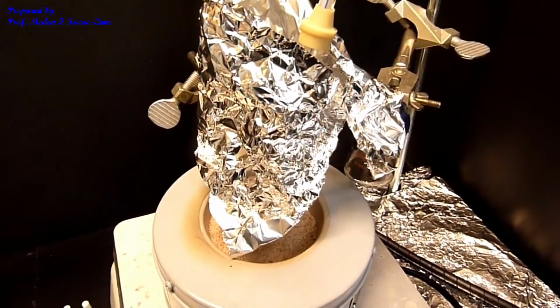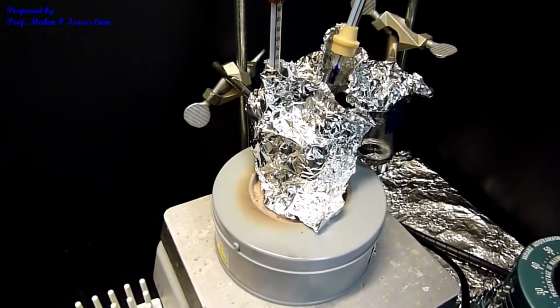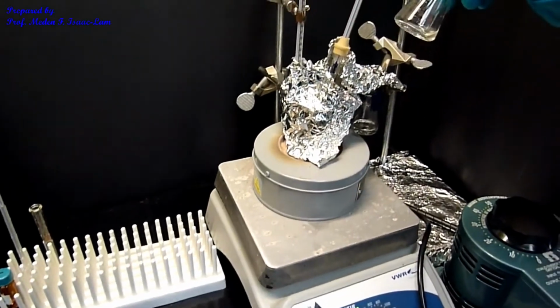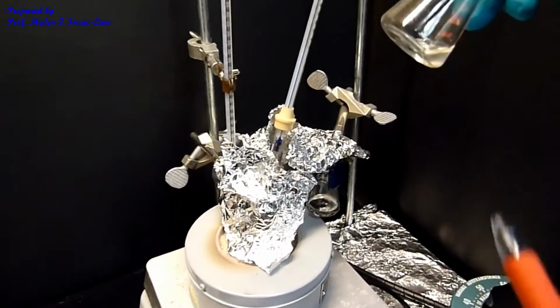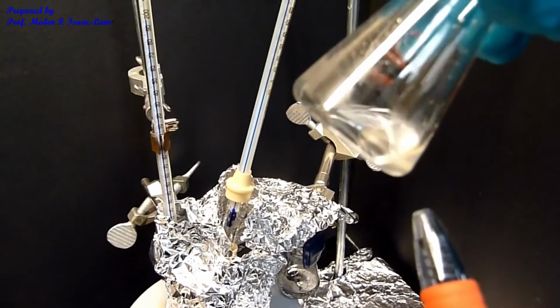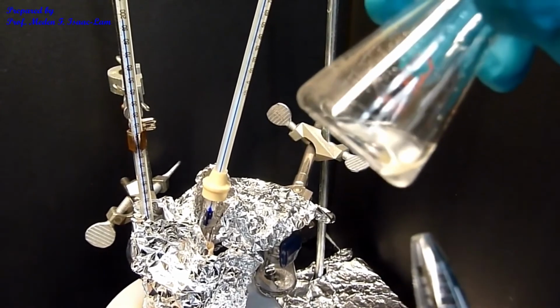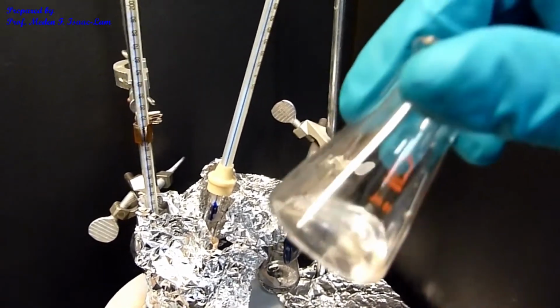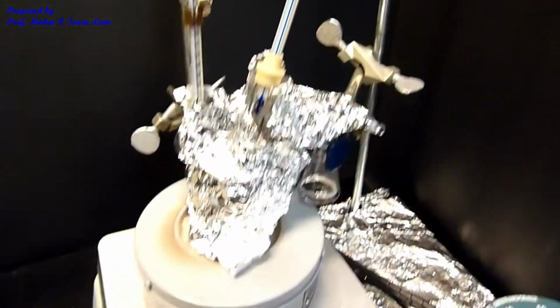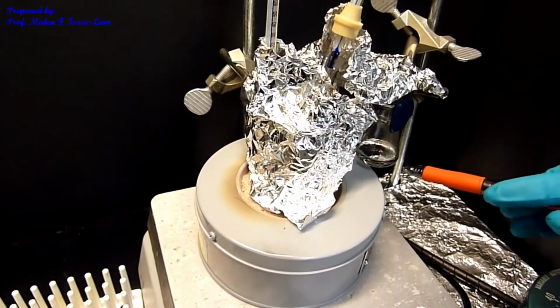using aluminum foil. So this is the distillation after about 20 minutes of distilling it. I isolated a low boiling component, and you can see that there's like a blob at the bottom. And that's the water that comes out, because one of the byproducts of esterification is water. Although some of this actually is the esters, I'm going to collect that one too. But I now have enough sample for us to analyze.